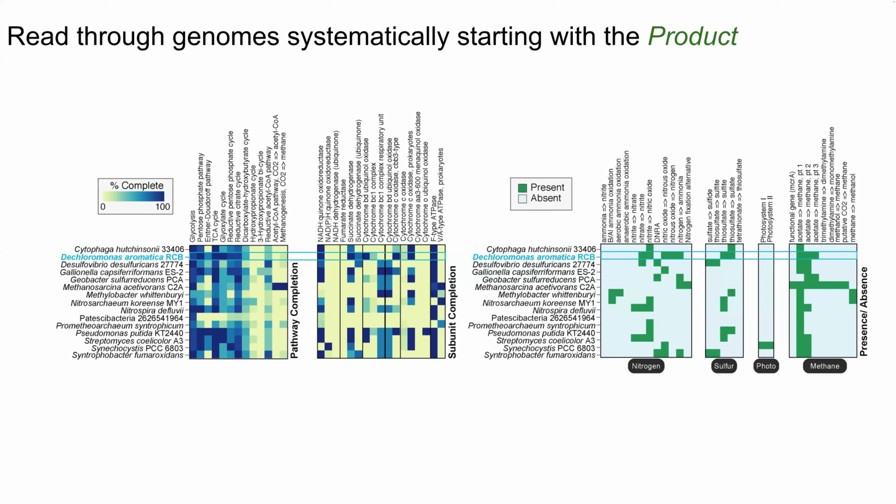If you go to the metabolism summary though, you'll see whether your genome has just one copy or 4. That's where you go into DRAM and see exactly how many copies you have. You can go deeper into it, but this is just saying at least one.